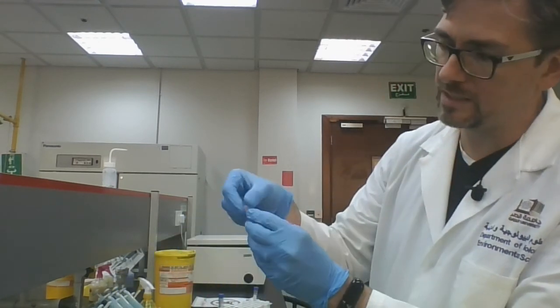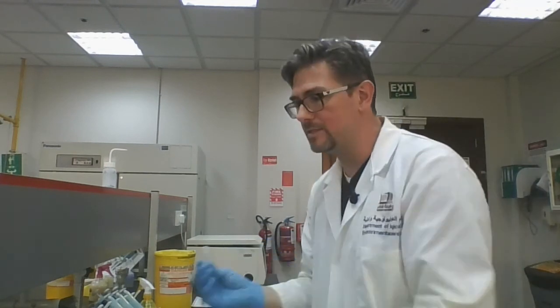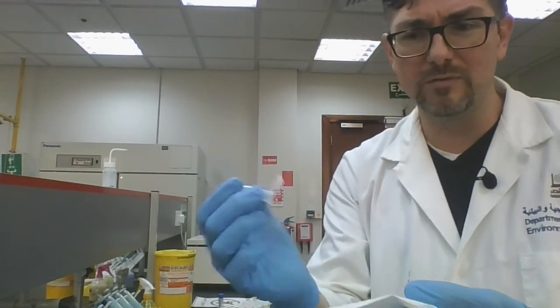So once the spill is cleaned up and we have our tubes ready to go, I just need to remove the ethanol. Now, you don't want to leave your pellets in the ethanol for too long. Again, it's a wash step, so you're trying to clean this up a little bit. What we're doing is trying to remove any more of those salts that might be dissolved in that pellet. So that pellet might become a little bit less visible. You also want to be a little more careful because the pellet might have become a little more loose at this point. It might have moved. So again, you're still trying to remove as much ethanol from this as possible.